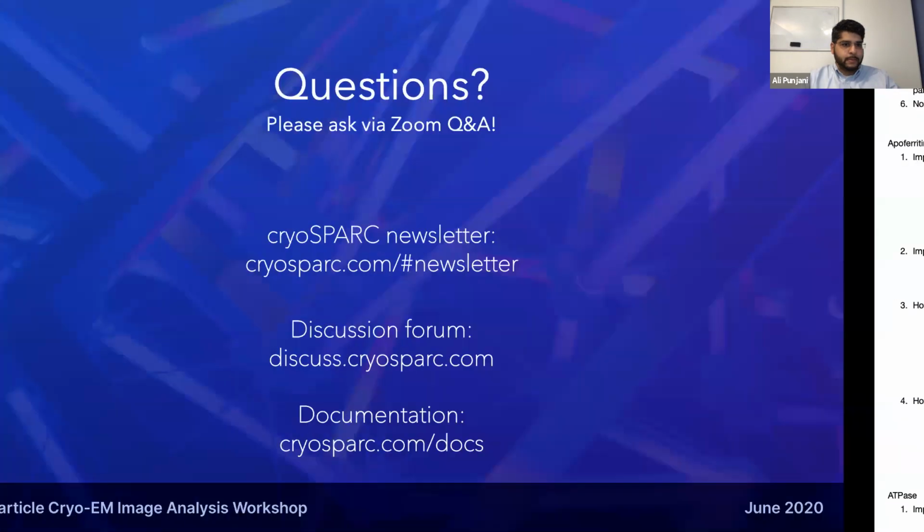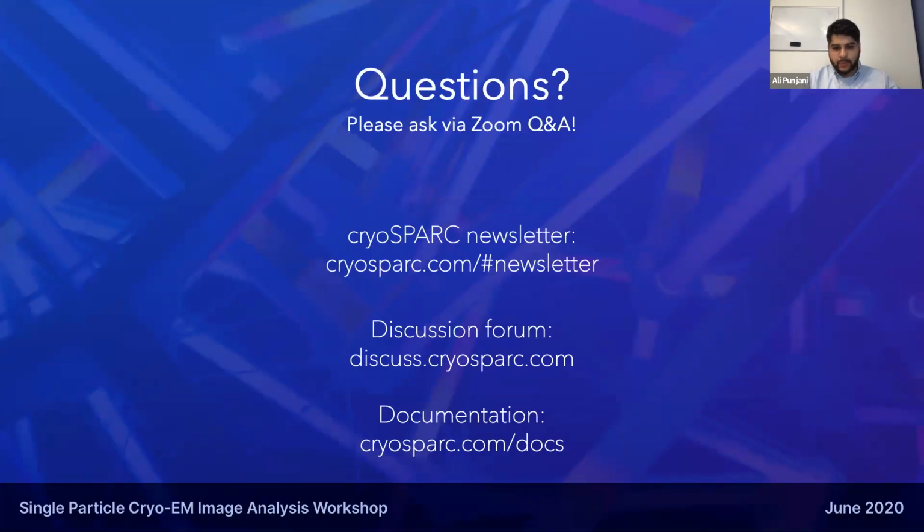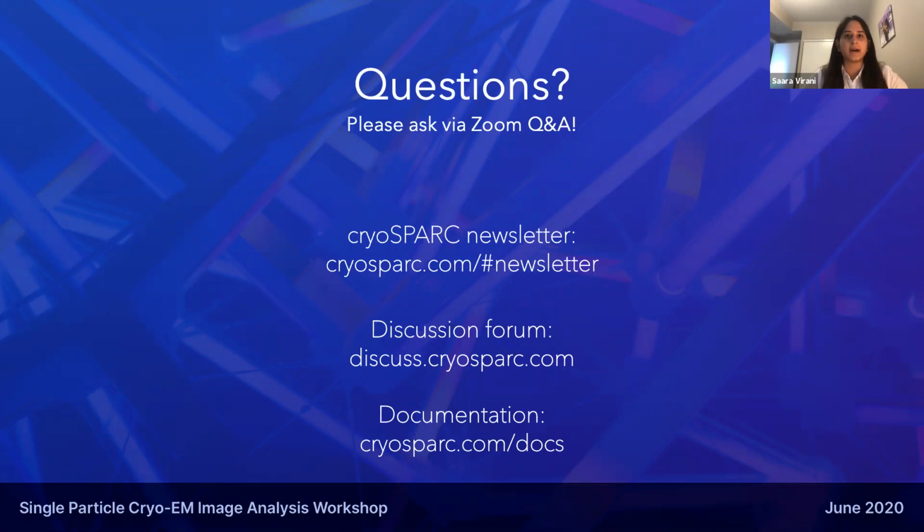Okay, I think this is another natural point for any questions, if there are any from the preceding sections. Yes, perfect. So overall, I think the flavor of questions regarding CTF refinement start off with, when exactly in my data processing workflow should I even be considering doing CTF refinement? What do I already have to have in order for this to be useful?